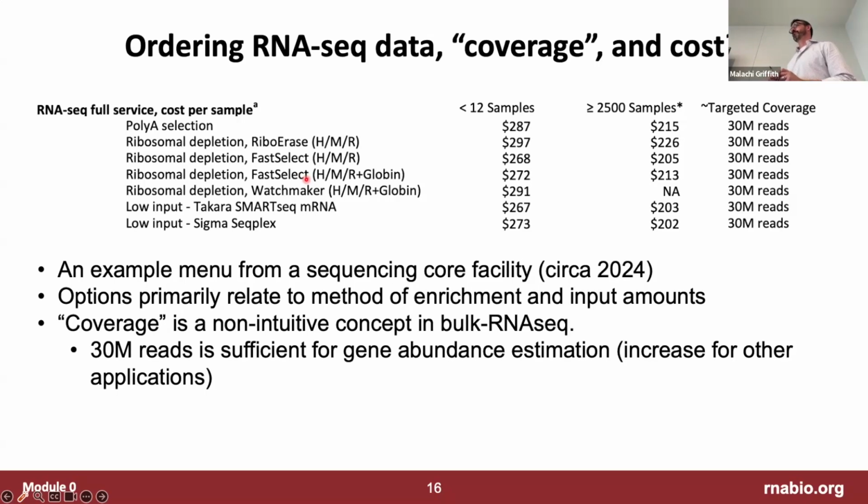Okay, so the question is, imagine a scenario where you're growing cells in culture and you basically take all of the cells and put them into one RNA prep. And so you've sampled the whole biology of that experiment, essentially. Now you have this pile of RNA molecules and you're going to make libraries from it. Do I need to make multiple RNA libraries from that, like different aliquots from that one RNA isolation?